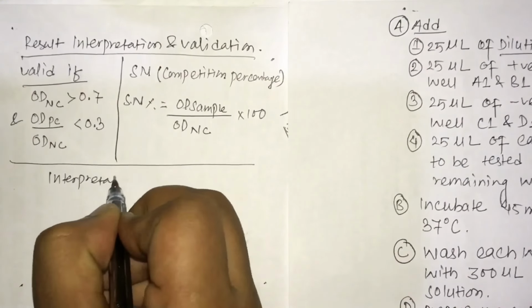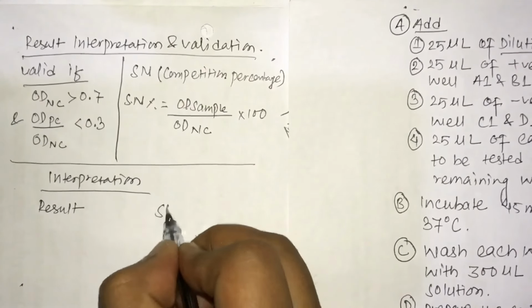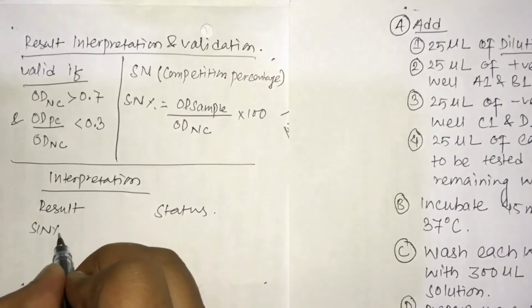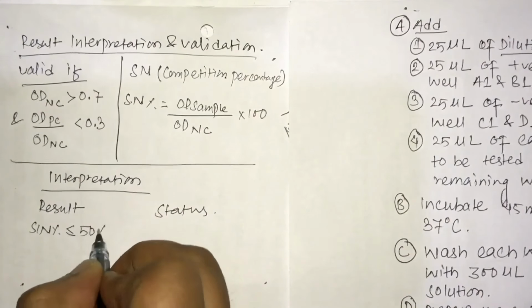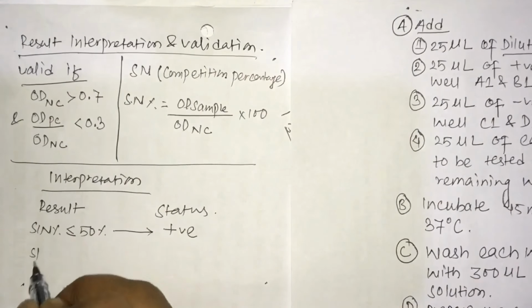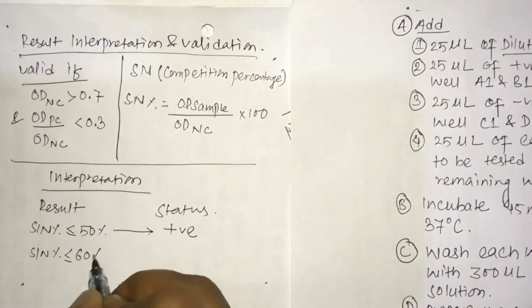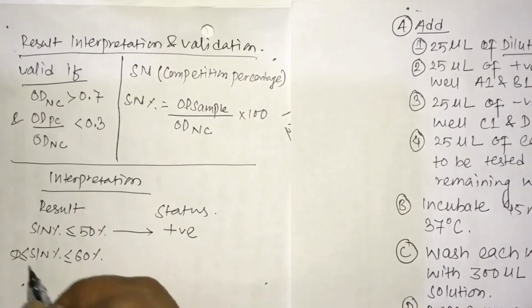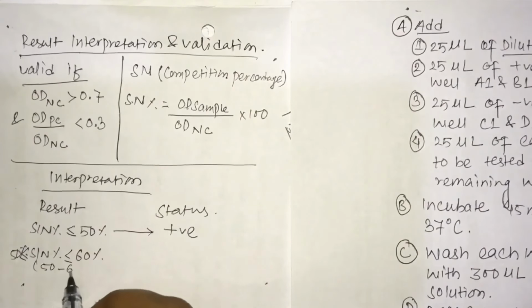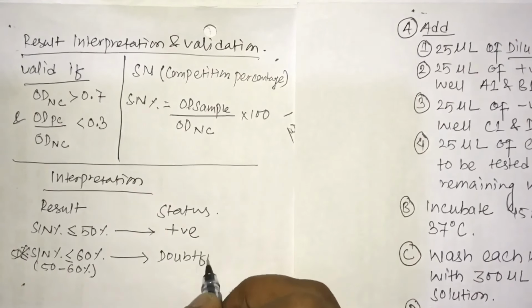Now to check the interpretation of the result from the sample, if the SN value, that is the competition percentage, is less than 50%, then the sample is positive for the test. If it is between 50 and 60, then it is doubtful. If it is greater than 60, then it is negative. So this is how the result is interpreted.